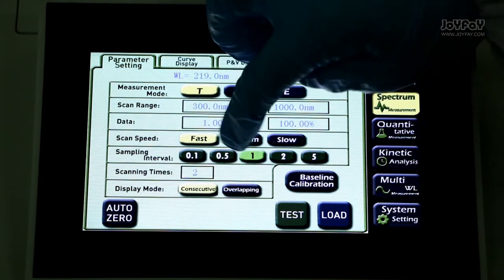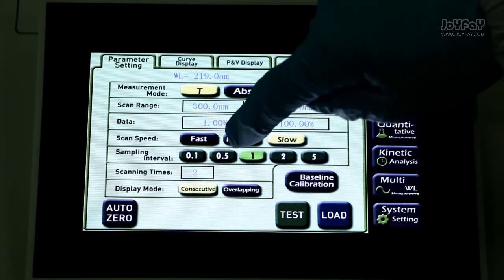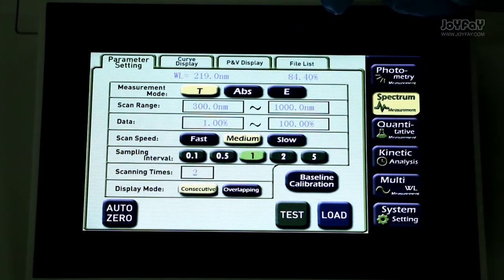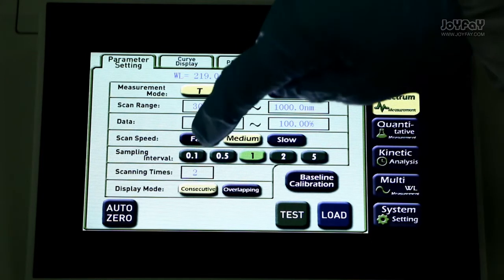There are three types of speed: fast, medium, and slow. We will choose medium. There are five interval options. Let me choose one.